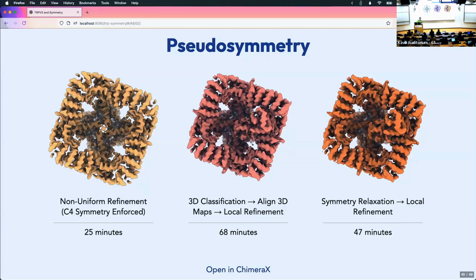In practice, I think it's fine to mostly use CryoSPARC's, the one that was generated during the refinement, but often your 3D classification works best if you also use a focus mask, which is the other kind that you can make. And we'll talk about that more in a different case study. And I find that if I'm already making a focus mask anyway, it doesn't take much more effort to make the solvent mask that I want. So I usually make them by hand. And it's good to get practice making masks. So, yeah. I think let's go ahead and end questions there, and we can do more at the end.